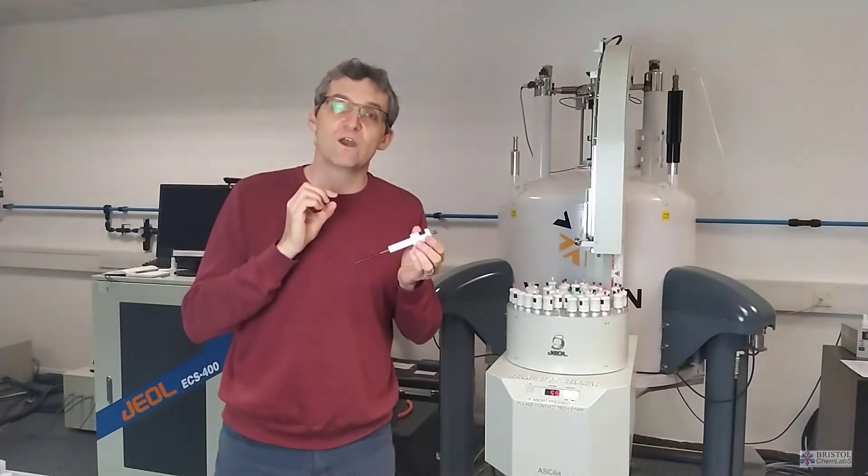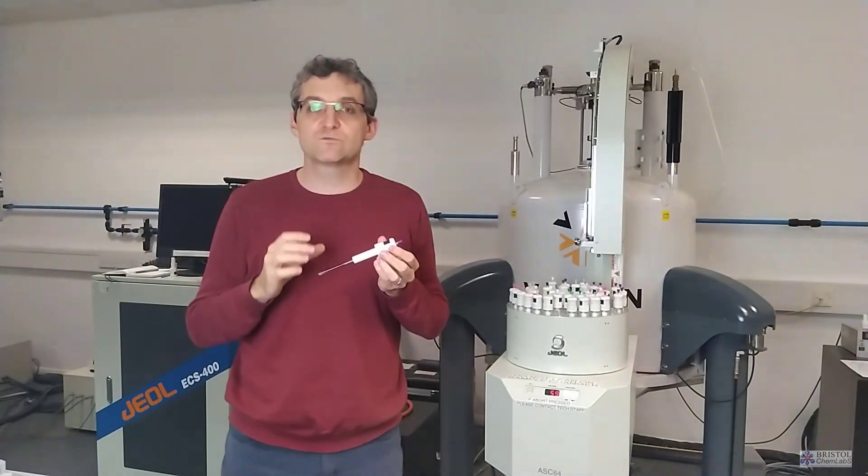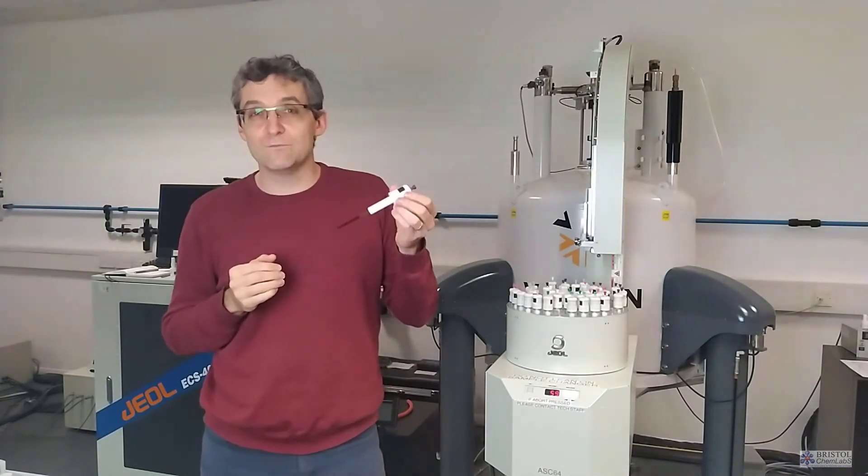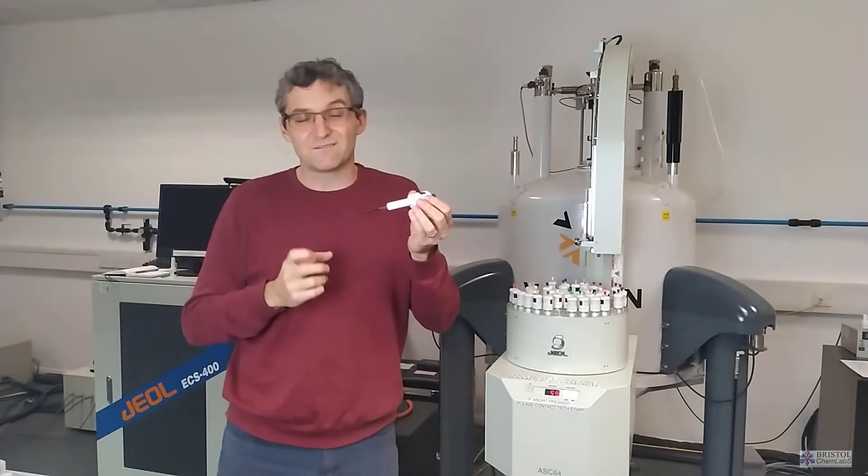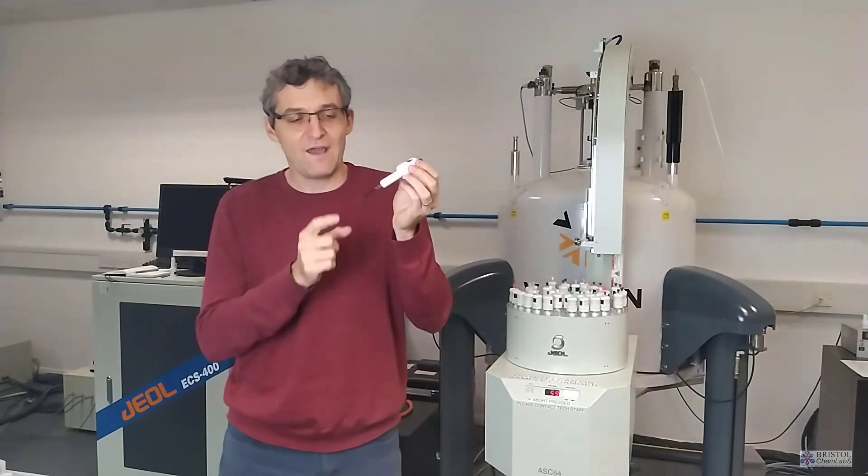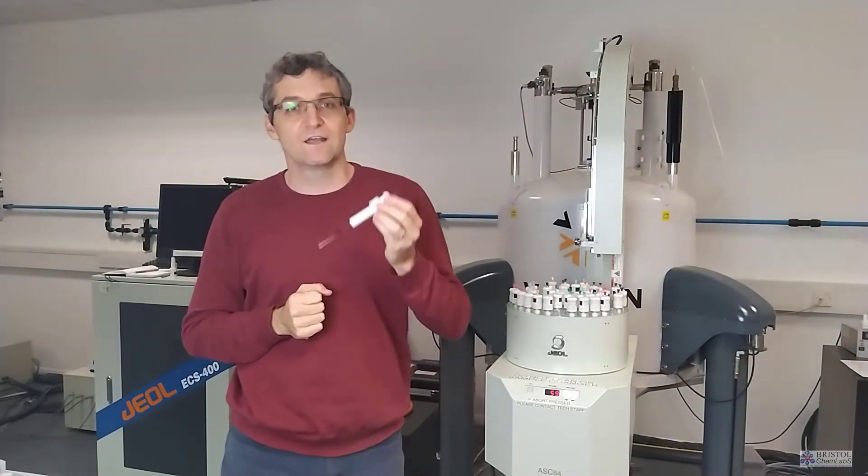Instead, we use a special kind of solvent where all of the hydrogen atoms are being replaced with deuterium isotopes. And that means we don't get any signal from the solvent in the NMR spectrum. But it also means that our typical solvents can range from around about 10 pence to about 10 pounds just for a single NMR sample. And if you imagine that we run 50,000 to 100,000 NMR spectra a year here in Bristol, the prices can rack up pretty quickly.